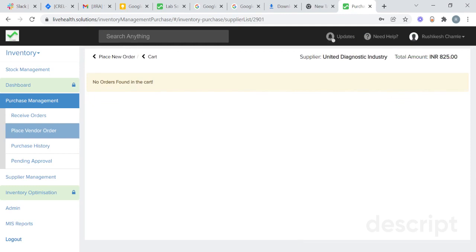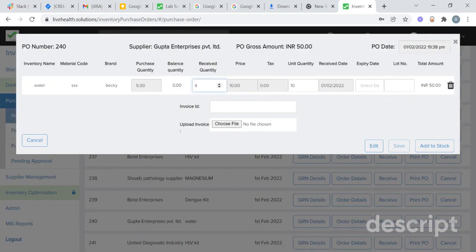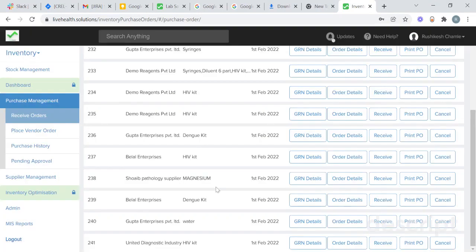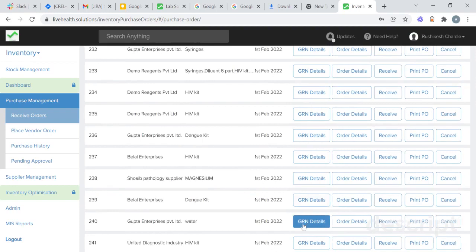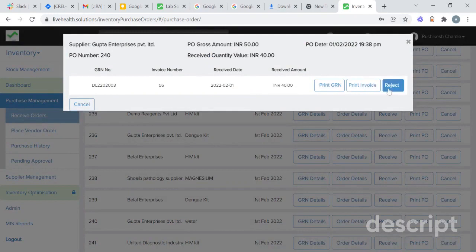When the supplier transfers that stock, you need to receive that particular stock. To receive the stock, go to receive orders. These are the products you need to receive. Suppose I want to receive four liters of water — select the expiry date, add the lot number, add the invoice ID, and click on add to stock. In GRN details, you will get details of the stocks including GRN number, invoice number, receive date, and the received amount. You will also be able to print GRN, print invoice, and reject the particular stock.